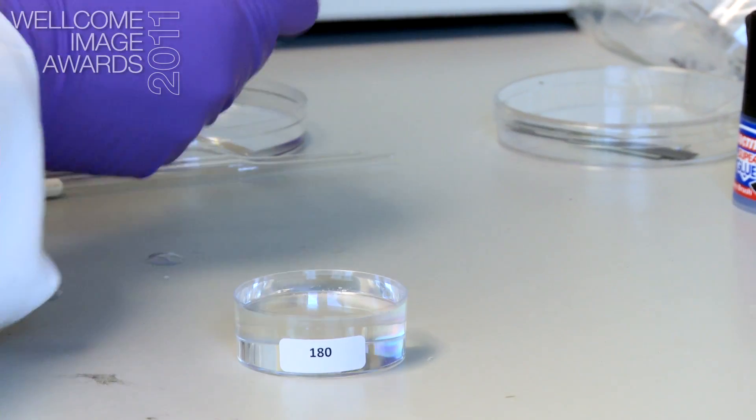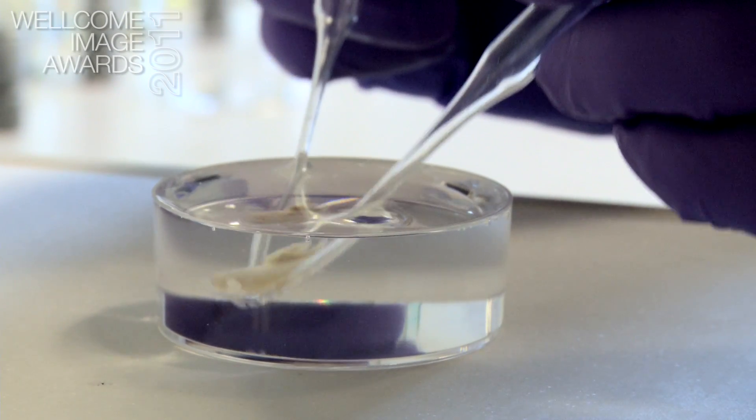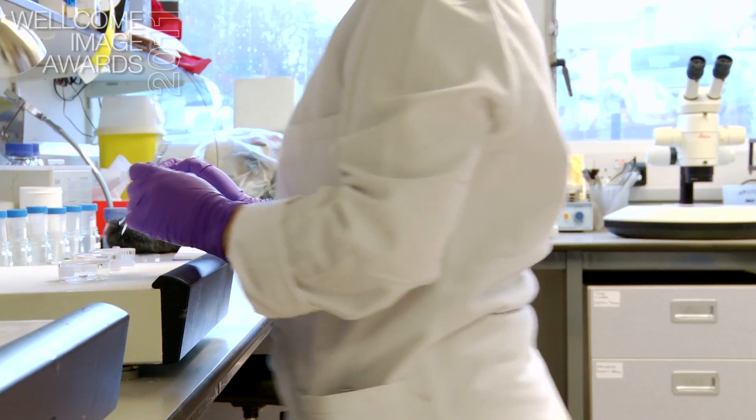The first step that's sort of OPT specific is to embed the sample in a gel so that it can be held firmly, so that when it's rotated within the machine we can rotate it to very precise positions.